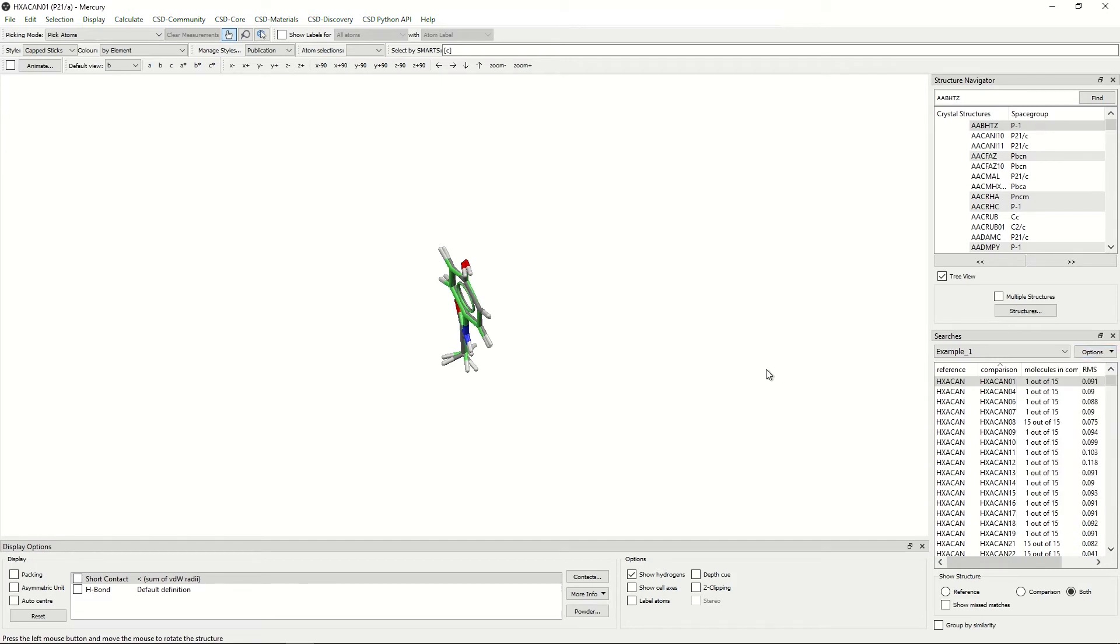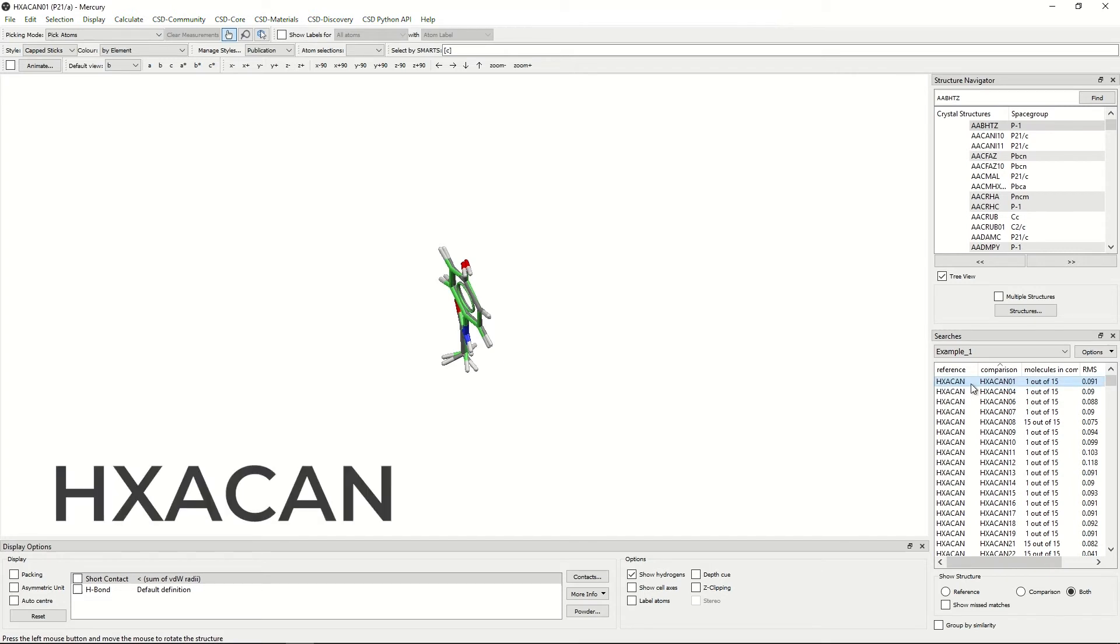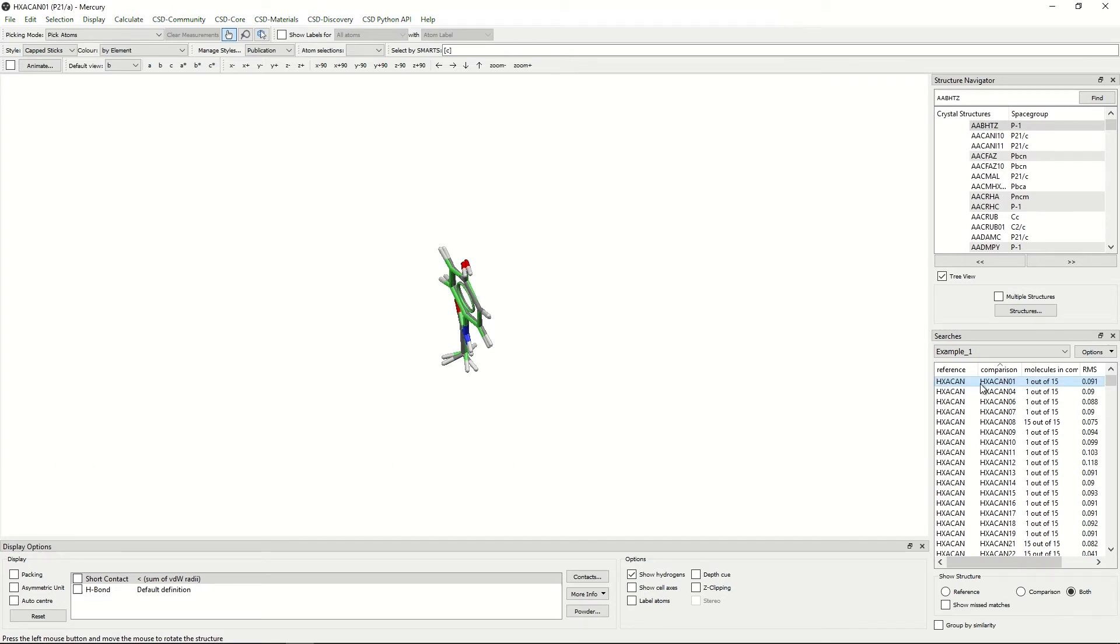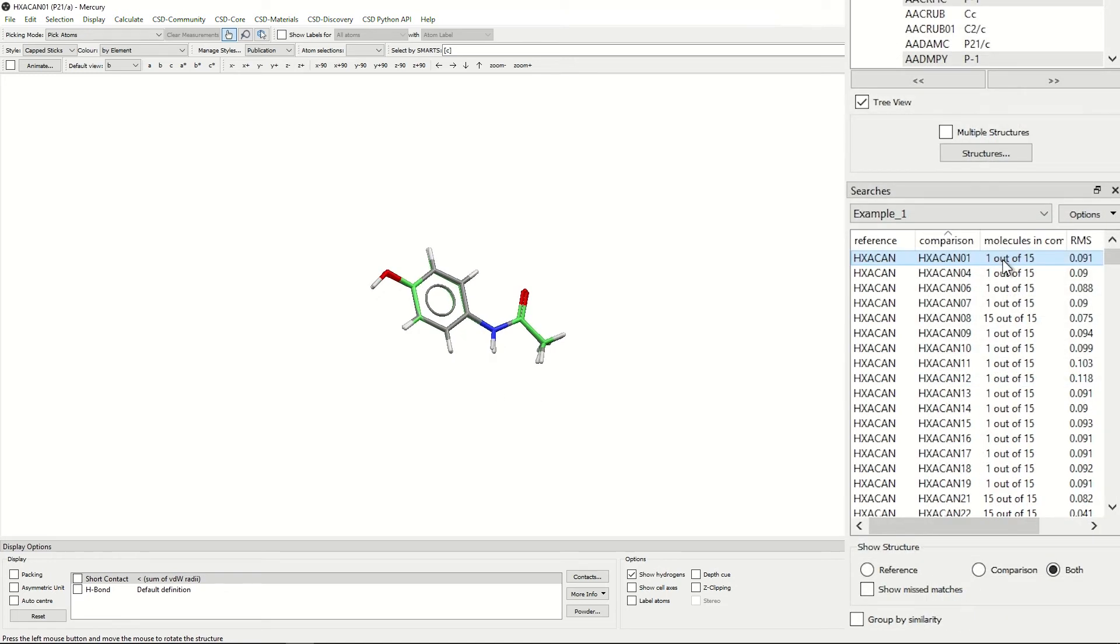The molecule that you can see on the screen currently is an overlay of HXACAN and HXACAN01. As you can see, only one out of 15 molecules is in common. That means that only one molecule was able to overlay and that's the one you can see in the screen in front of you.